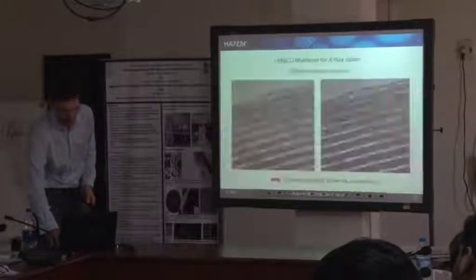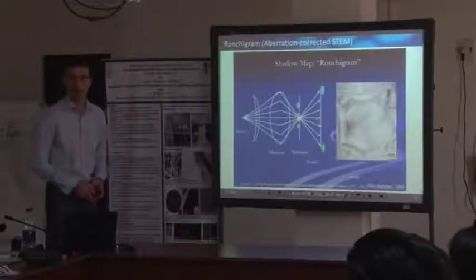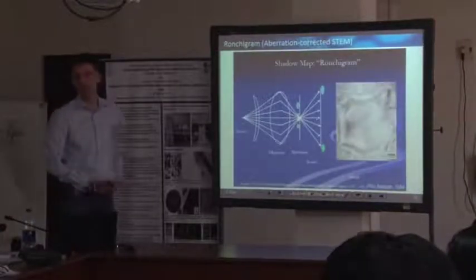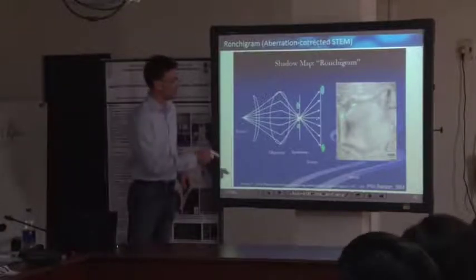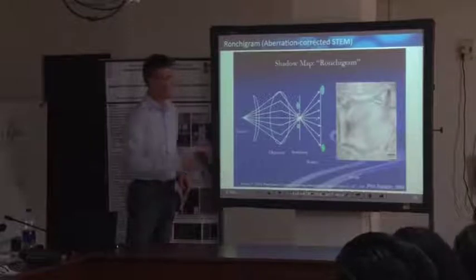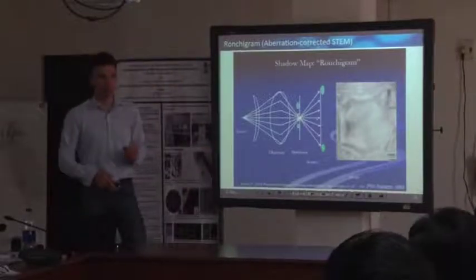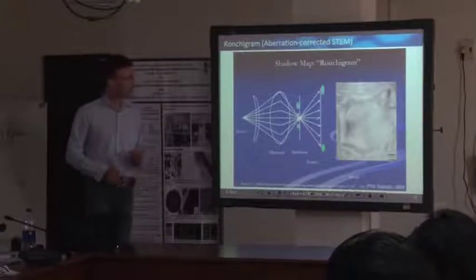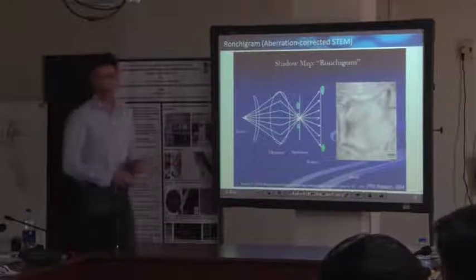I mean, let me just go here. This is how an aberration corrected electron probe looks like. We're going to come to that later. I just want to share that here. This is an aberration corrected probe, and instead of having just 10 milliradian in 200 kV, this is already roughly 50 milliradian.